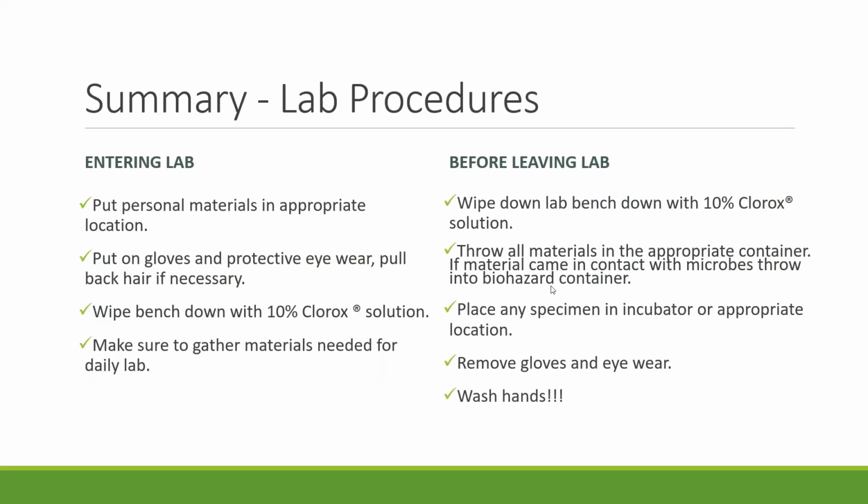So a couple things, because we've hit on a few little things here and there, and just to put it all into perspective. When you were talking about lab procedures, when you first walk into the lab, you should be storing all your personal items properly and safely. Then you're going to go in and wash your hands. Then you're going to put on gloves and eye protection if necessary. Make sure your hair is pulled back, and then you're going to disinfect your workstation. Usually we do that with about a 10% Clorox bleach solution.